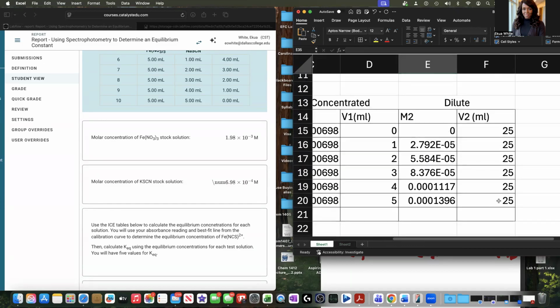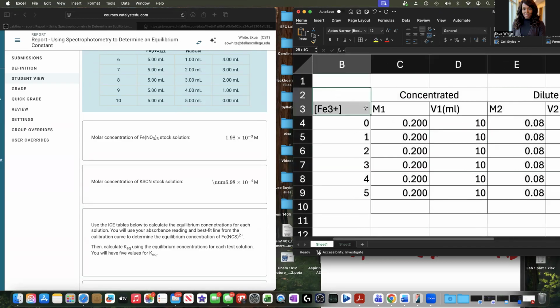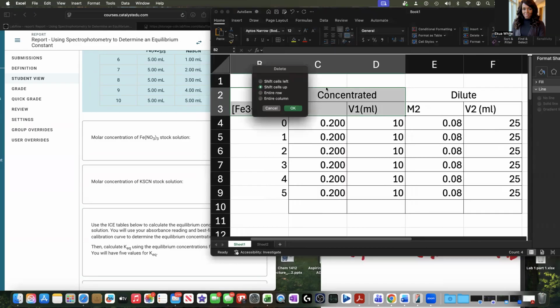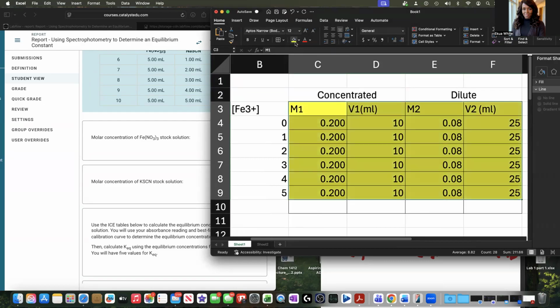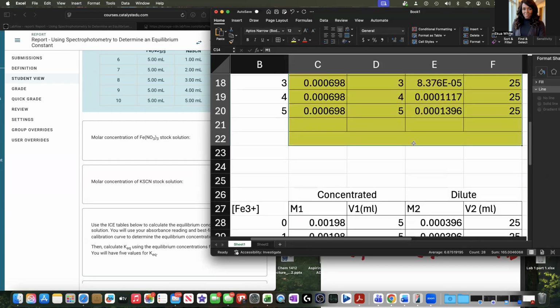This is the first one. Let me actually color the first one so I don't confuse the two, right? I'm trying to do too much here, trying to get this thing done. Is there any way I can minimize this? Wait, cancel. Okay, let me just highlight this part so I recognize I'm on top. This is the original one. I'm not working on this one here. I'm working on the bottom one, the one without the highlight.